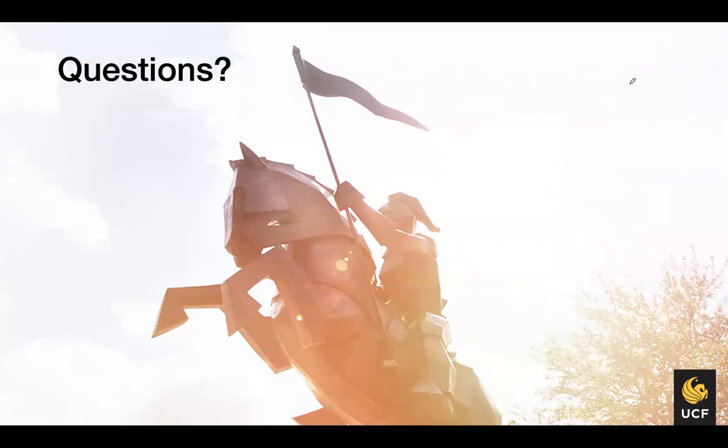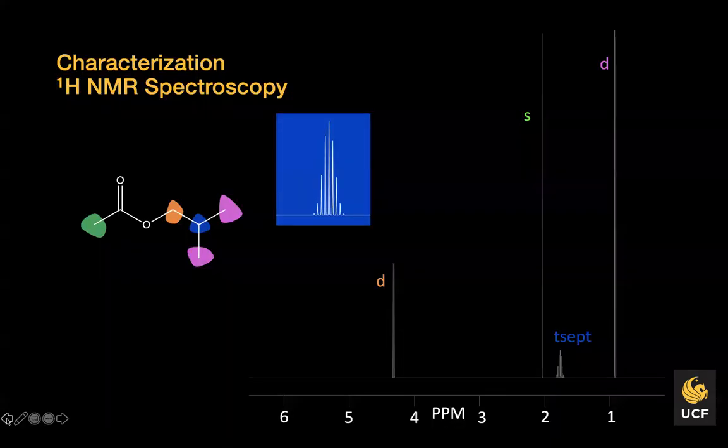Jasmine, was acetic acid extracted with 10% sodium carbonate? Also, what was extracted with the last addition of DI water?